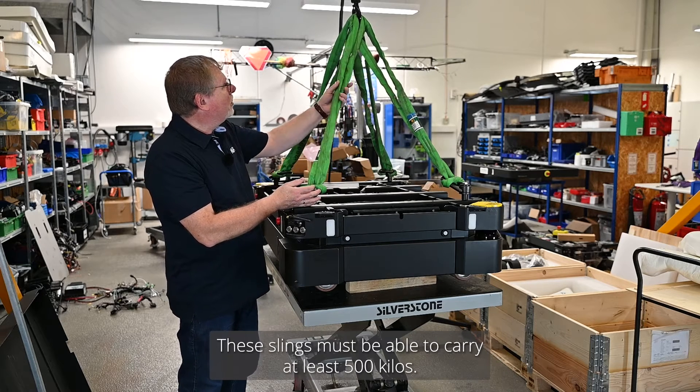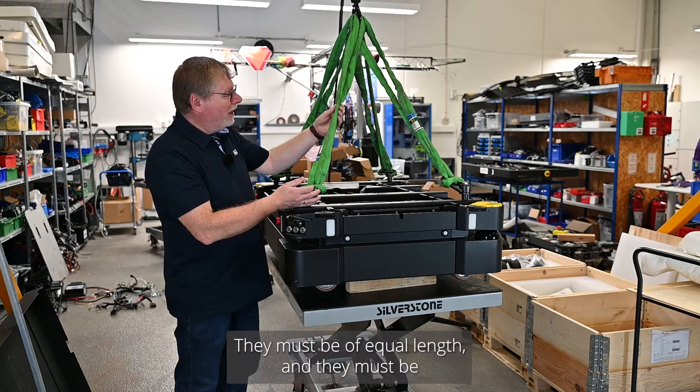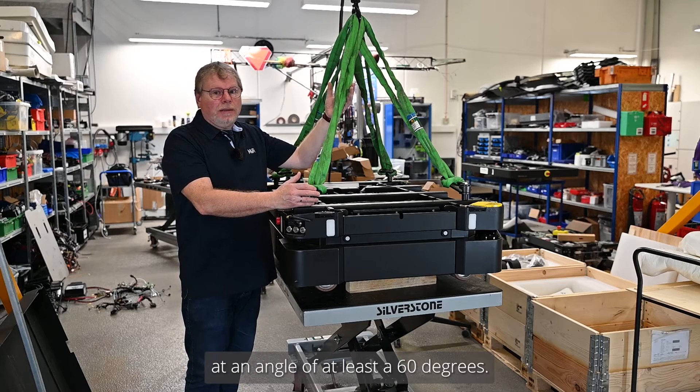These slings must be able to carry at least 500 kilos. They must be of equal length and they must be at least a 60 degree angle.